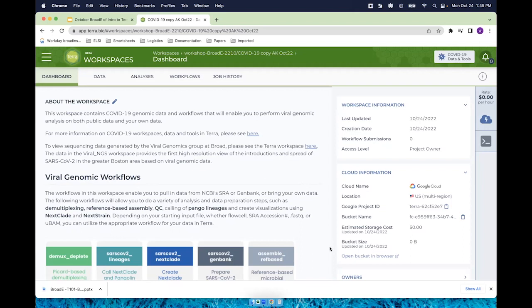I just wanted to make a comment about Google's pricing change. Everybody will be getting an email either later today or tomorrow about the multi-region pricing changes. Historically, many people used the multi-region because you didn't have to remember where you were putting your data, because you paid a little bit more and it could be available everywhere. The pricing change is substantial, but we have about 18 months of a pricing freeze.